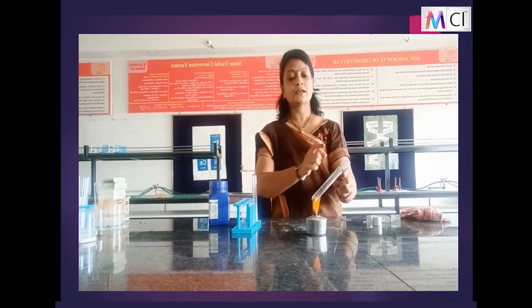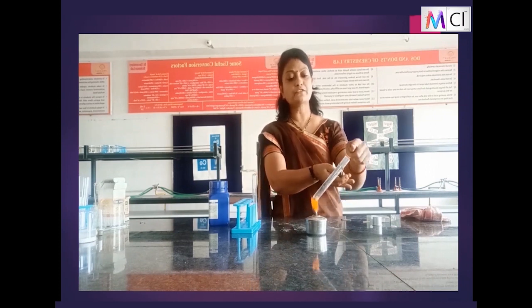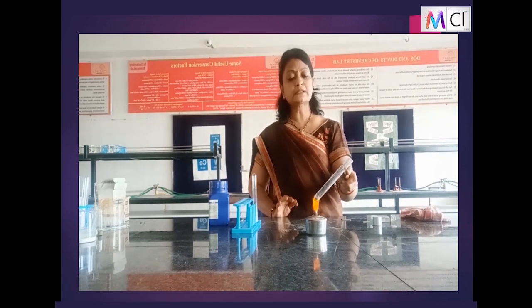Along with it, we will try to observe if anything more is added as a byproduct. Yes, see children, you can observe the fumes which are coming out, right? These fumes are of sulfur dioxide and sulfur trioxide.